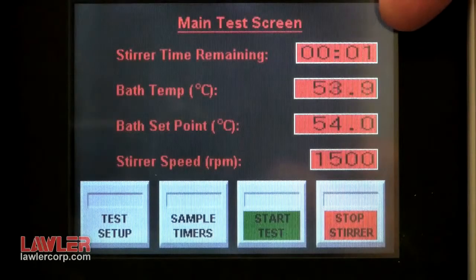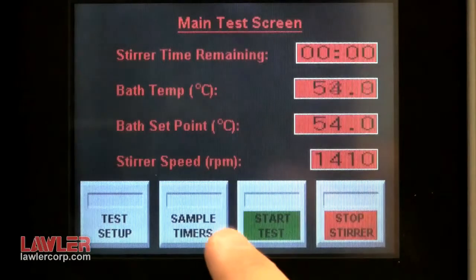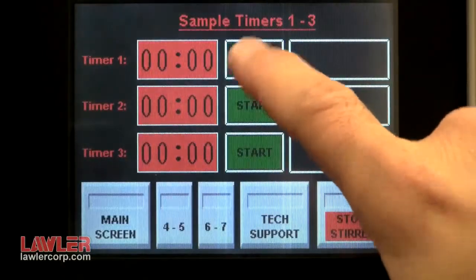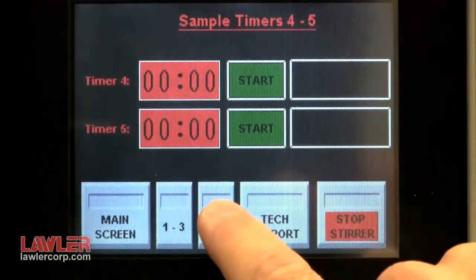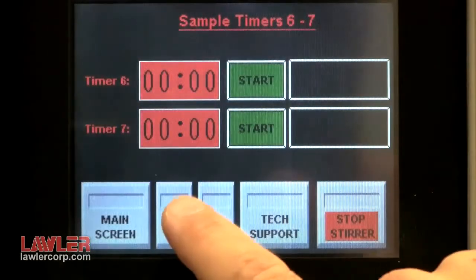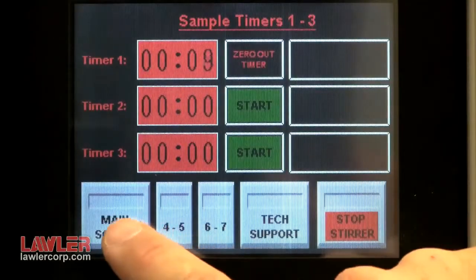As per the D1401 test method, at the end of 5 minutes, the unit stops stirring the sample. Press the convenient touch panel timer to begin counting the time for separation to take place. Seven timers are provided, one for each sample position.